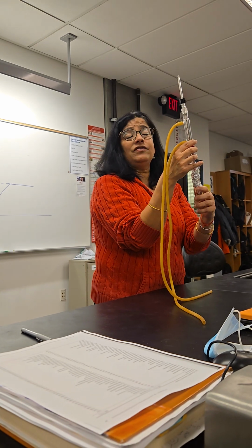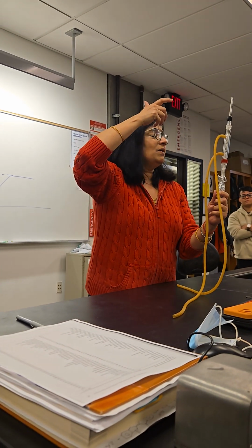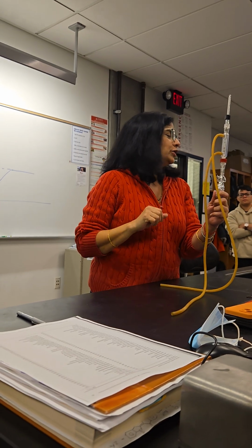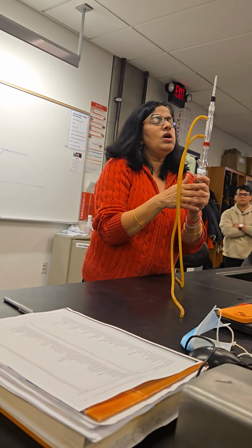And that allows the vapors to then get enough energy and be able to go. Should we do that? And crank up your hot plate. Yes. Should we do that even if, or sure. I mean, there's no harm in doing that.